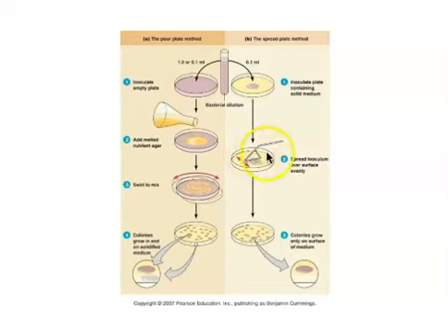Remember, this sample that I spread all over this plate, ideally, it allowed me to separate each individual cell away from all the other cells and give each cell a place on the plate to start growing and produce a colony. But sometimes 2 cells or even 3 cells might land right on top of each other. And those cells will then create a colony that didn't come from a single cell, but actually from multiple cells.